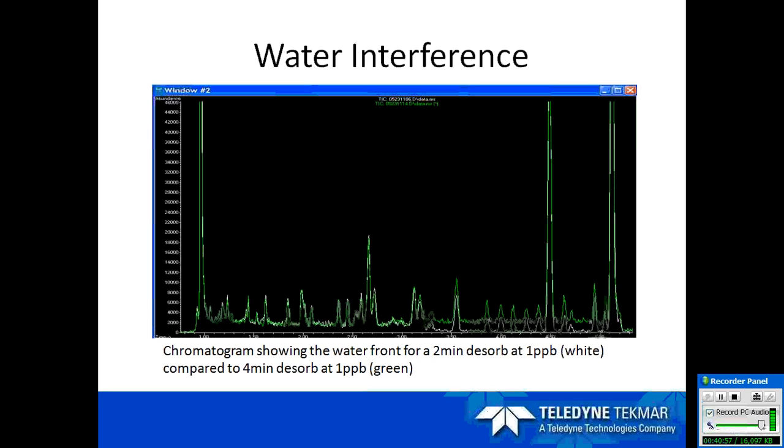And also you can see the elevation in the 4 minutes, which could cause some effect on your recoveries of your sample because your baseline is high. And make sure your waterfront is consistent. If your waterfront is not consistent throughout, this could cause some problems within your system.